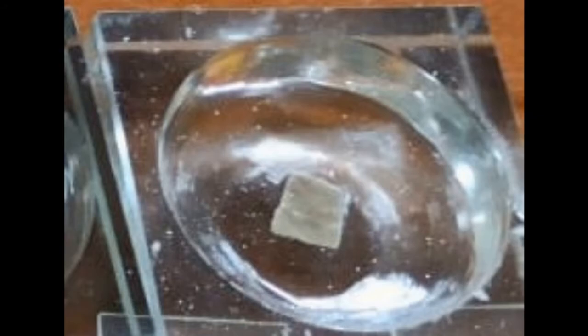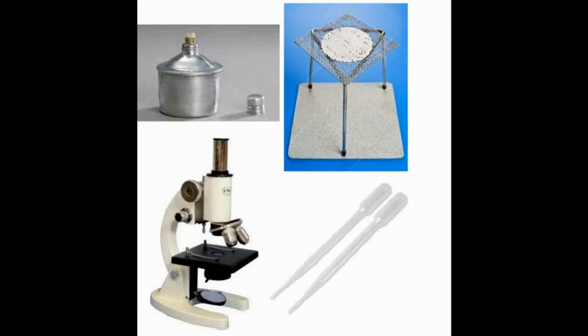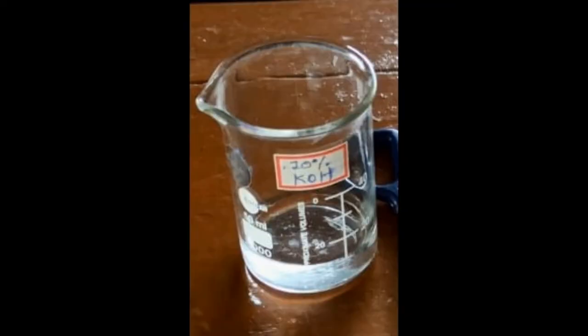For mounting of placoid scales we require a piece of skin from scoliodon. After removing the piece of skin we have to clean it. Apart from that we require beakers, bent scissor, forceps, cavity blocks, slides and cover slips, spirit lamp, tripod stand with gauze, microscope, dropper, and 10% KOH.